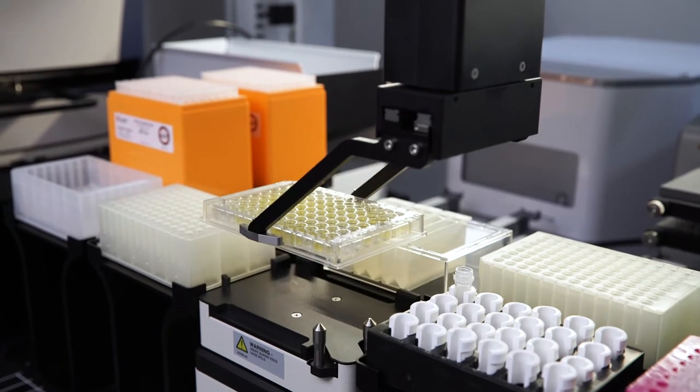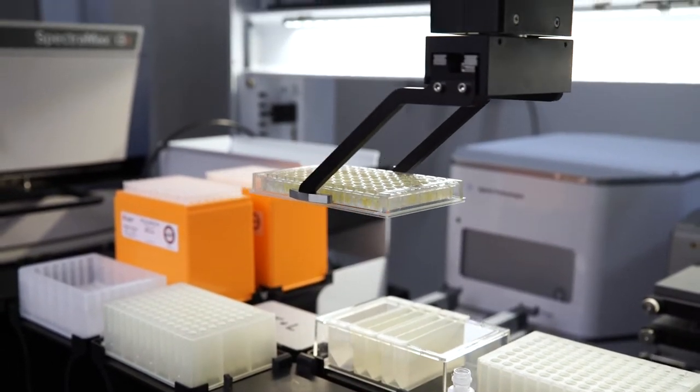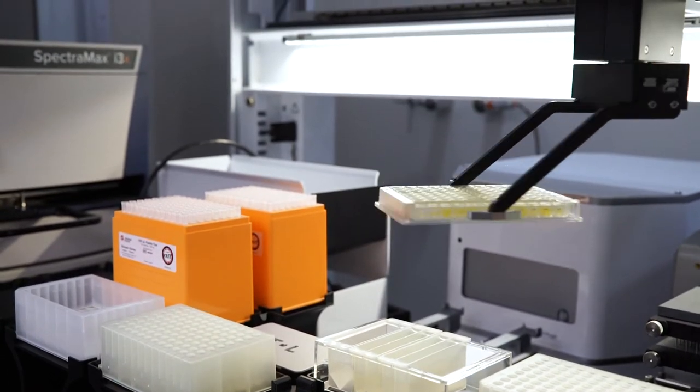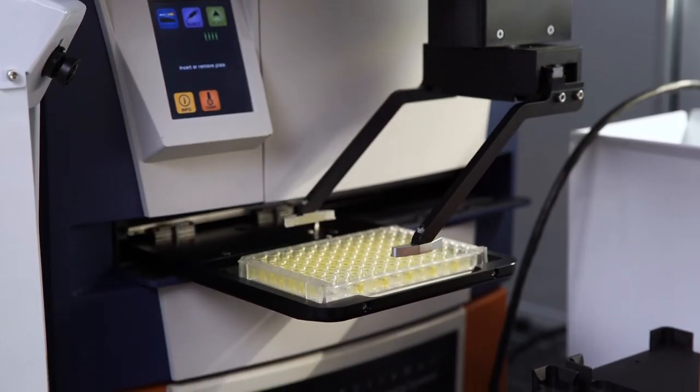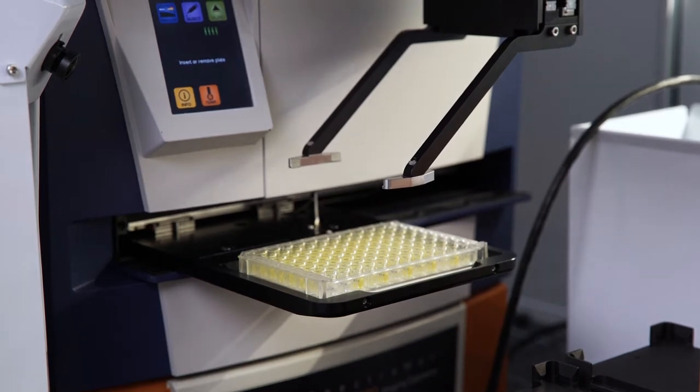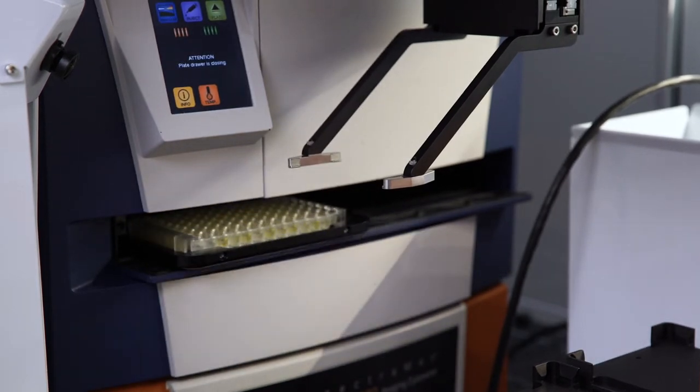Equipment and analyzers used during the ELISA process, such as plate readers, washers, and incubators can be connected to the Biomech to achieve complete workflow automation. The high-access rotating gripper allows direct device integrations, reducing the overall cost of automation.